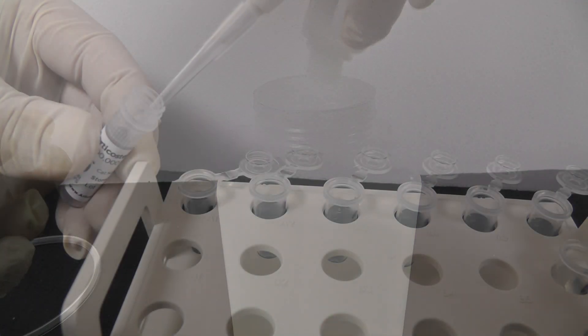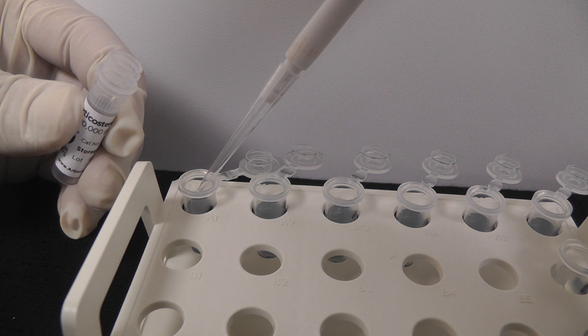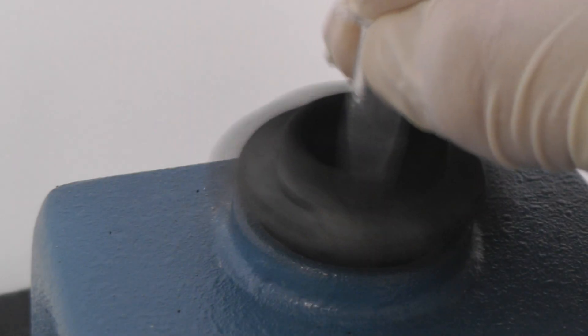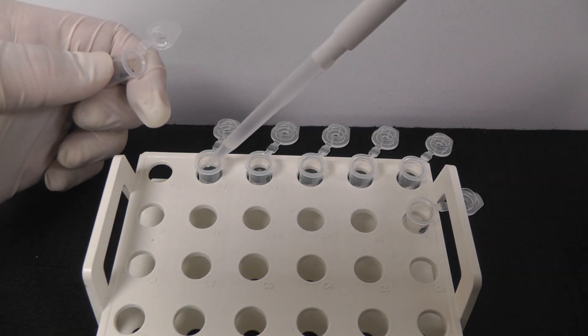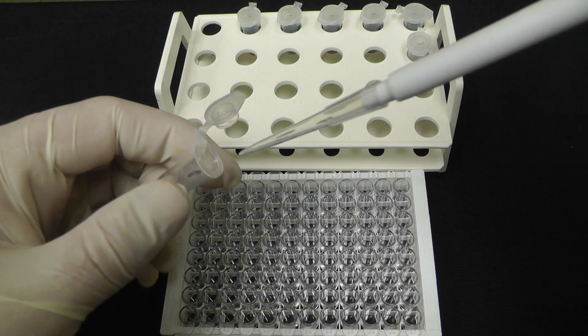Reagents, standards, and samples are prepared according to the manufacturer instructions. Here we've prepared seven standards in the range of 5000 pg per milliliter to 78.125 pg per milliliter of Corticosterone.